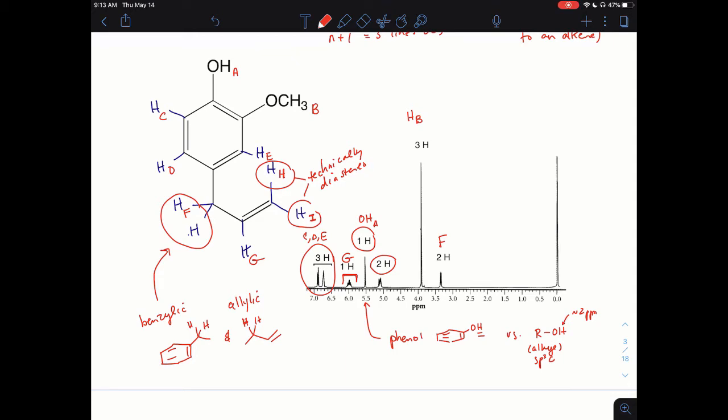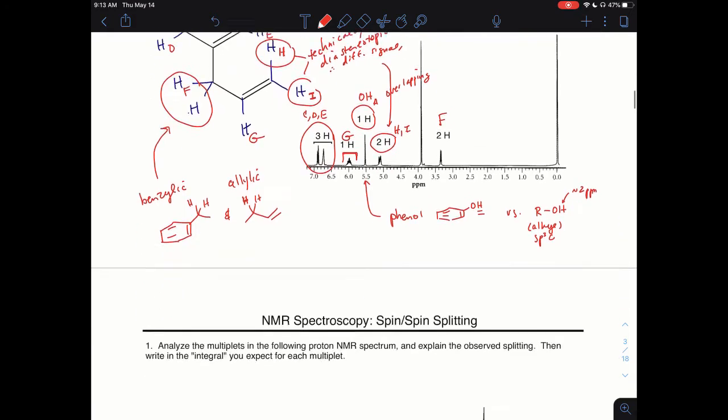And if you don't know any of the words that I'm saying, you probably did not do the guided inquiry questions, or you need to go back and do your reading and do your guided inquiry questions so you know what I'm talking about. So they should have different signals, but those signals are just overlapping. They're overlapping here. That's fine. They're just really similar. So they're overlapping, and those protons HH and HI, they're right there. Well, that was a fun one.